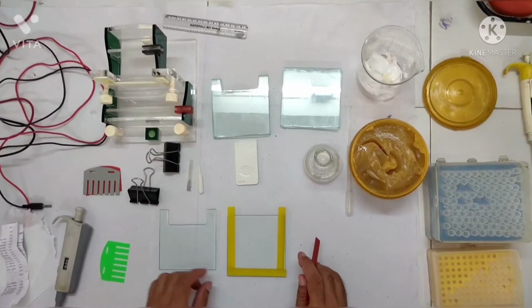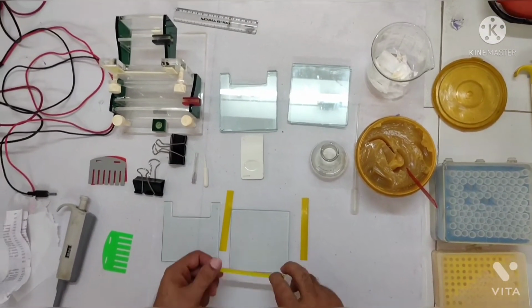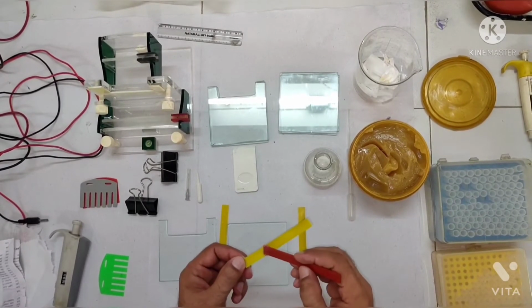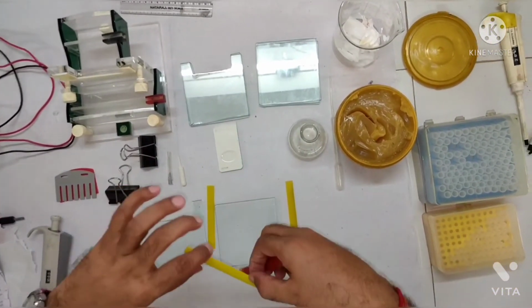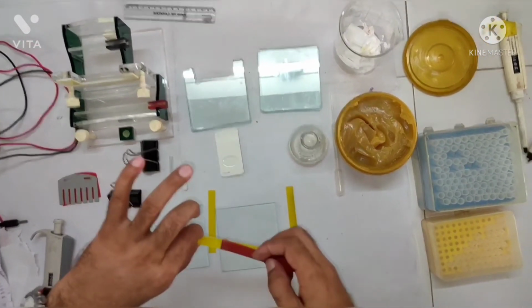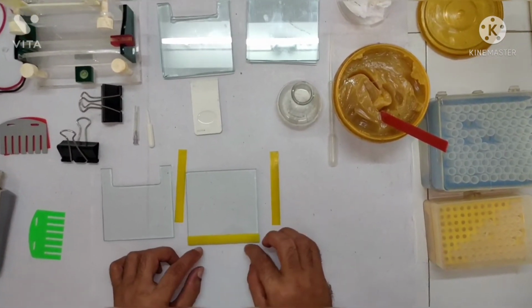We have to first seal the spacer to the plates. So these are the spacers, you can see here, these are the spacers. So 3 spacers are there, right? This is 1 millimeter thick spacer. So we can use grease, otherwise we can also seal without grease, but it is always safer to have grease, right? So we put grease to the one surface first like this, right? So it will stick your spacer to the plate, okay, and the chances of leakage become less then. So like this we put first of all at the lower end, so just we kept here, right?